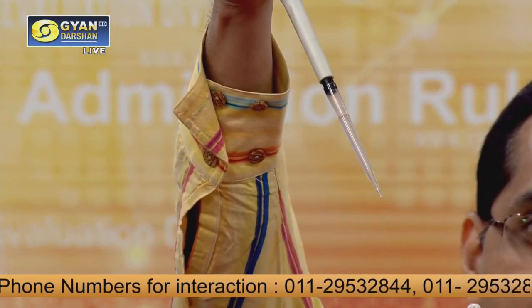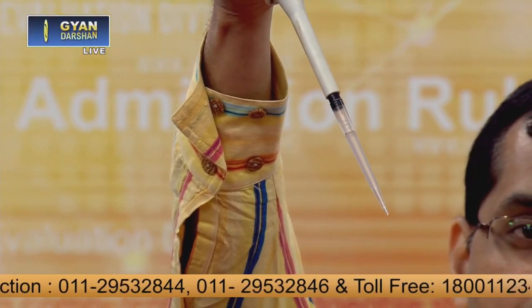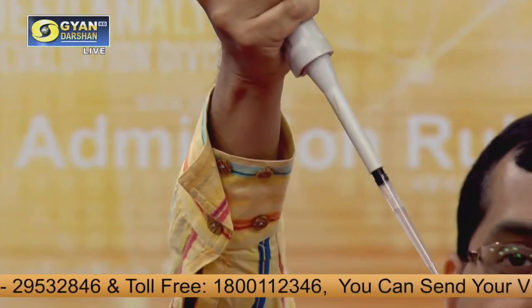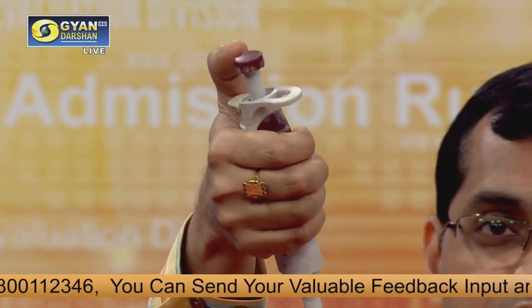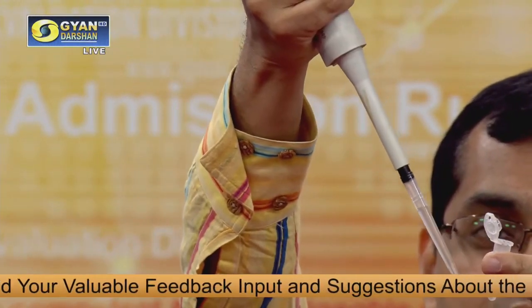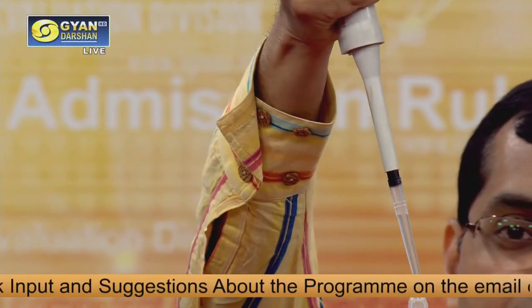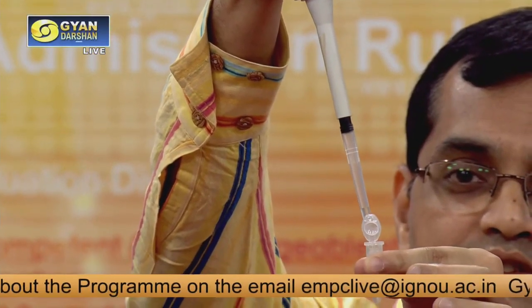So I have pipetted out the solution from the Eppendorf tube. If you need to add any solution, 200 microliter, how will you do it? You have to set the 200 microliter here and then add. Let's say there is the bacterial pellet here. You have to gradually add the solution like this. See, it is being added.